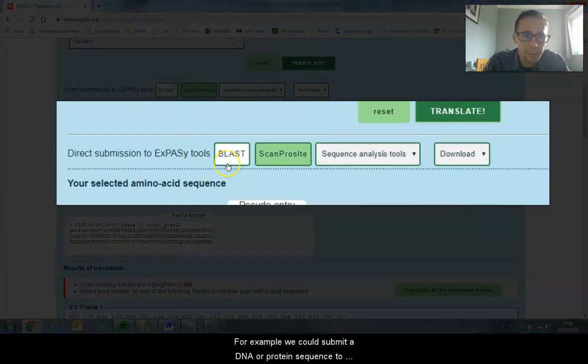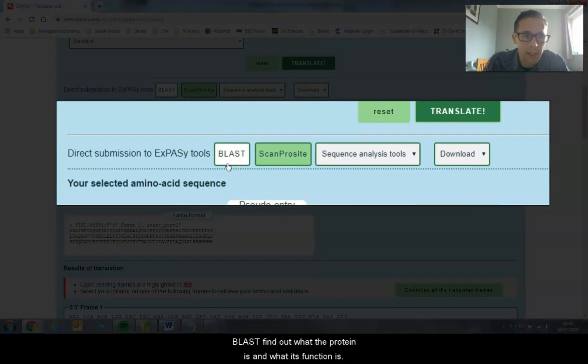For example, we could submit our DNA or protein sequence to BLAST and find out what our protein is and what its function is.